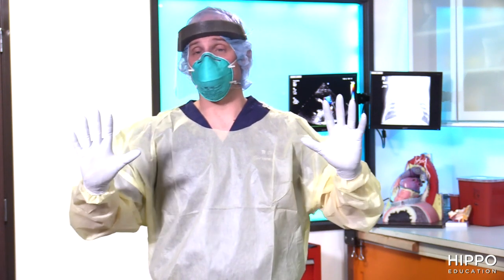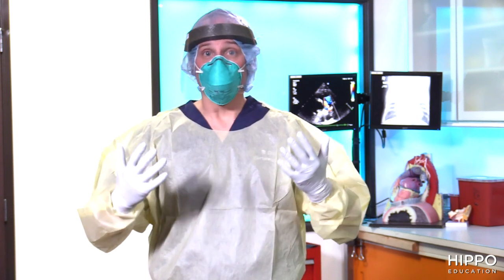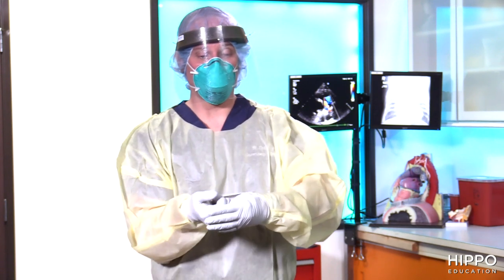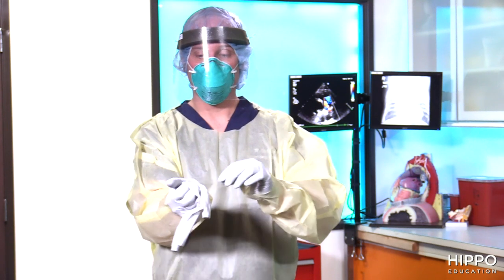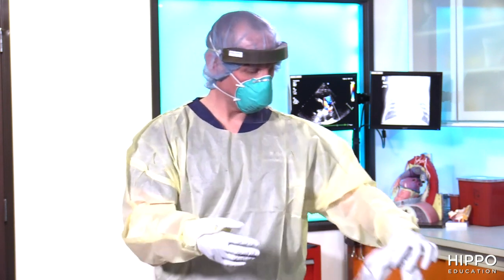You can clearly see I'm contaminated mostly at the hands and the chest. Let's now doff this PPE and hopefully I was successful. We're going to start off with our hand hygiene — that's the first step. So I'm going to remove my first set of gloves as my hand hygiene and throw those in the trash.